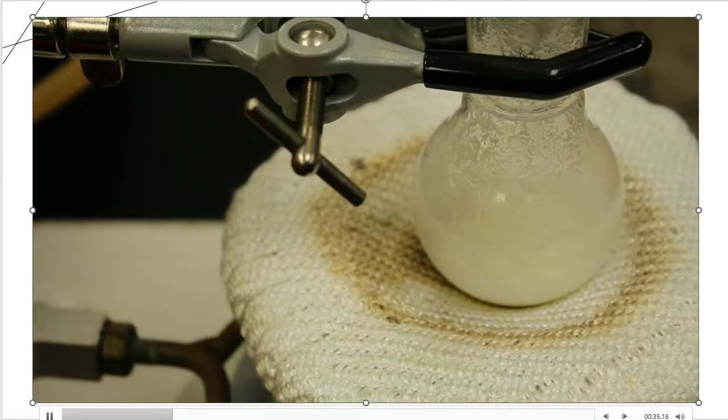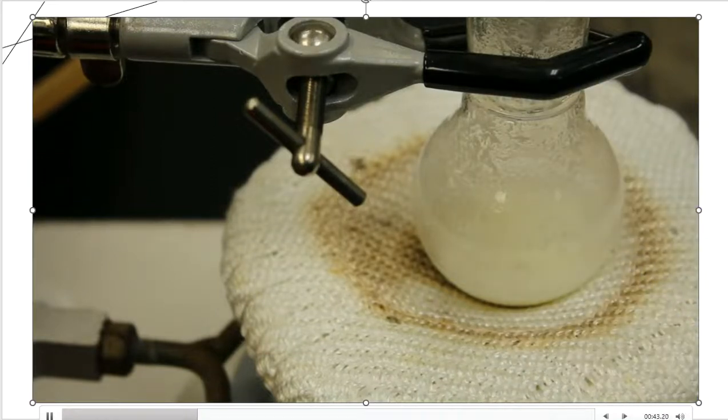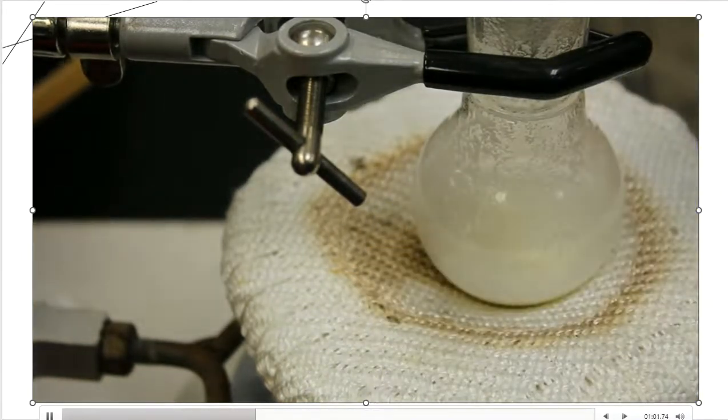So this Anisole is almost finished, and in the next step, it's telling us to take this solution that we have here and pour it over crushed ice. It's almost like I'm making a mixed drink. It's kind of strange, but it's one of the few times that we see something stated that way in a laboratory procedure. So I'm going to get a beaker of crushed ice. I'm going to take this solution and slowly pour it on top of the cold ice, and I'm going to allow it to get super cold super fast, and hopefully we start to see some product get formed from this reaction by doing that.